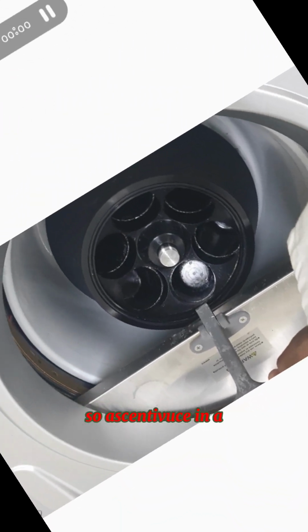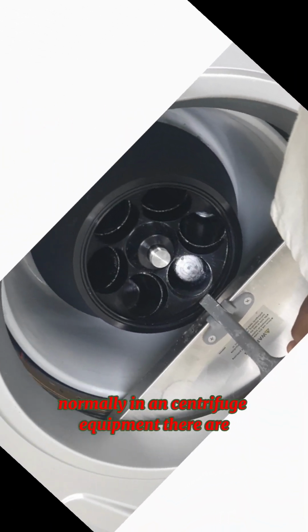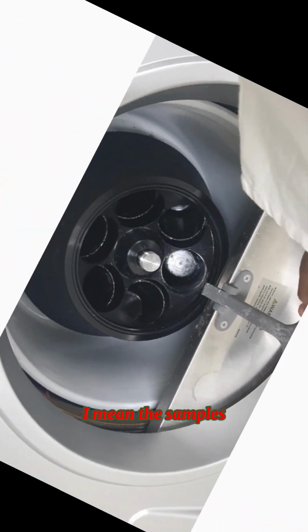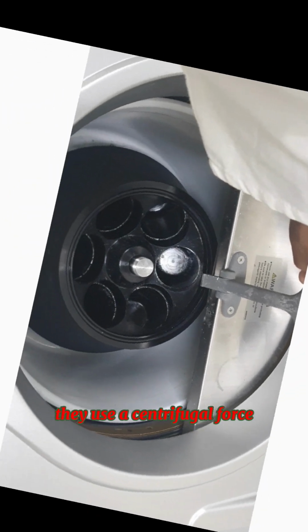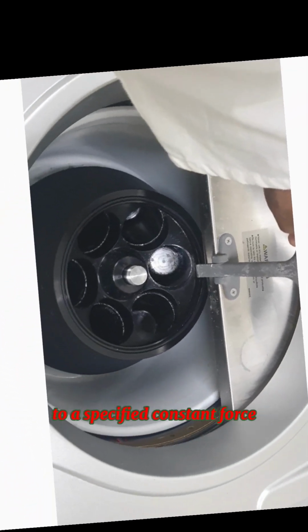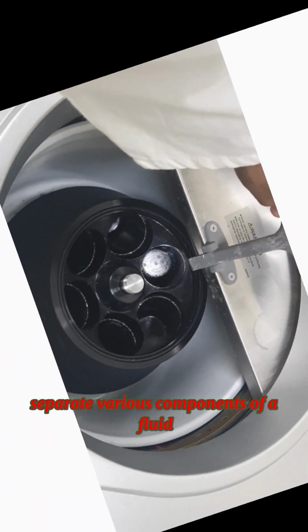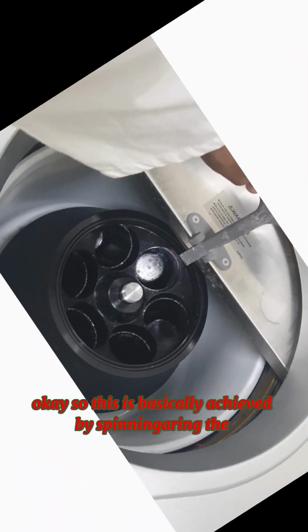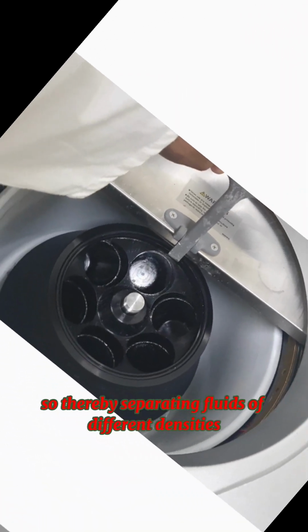So in centrifuge equipment, there is a rotor where we keep our samples. Usually these devices, as I told you earlier, use a centrifugal force to subject a sample to a specified constant force, for example, to separate various components of a fluid or from a fluid. This is achieved by spinning the fluid at very high speed within a closed container, thereby separating fluids of different densities.